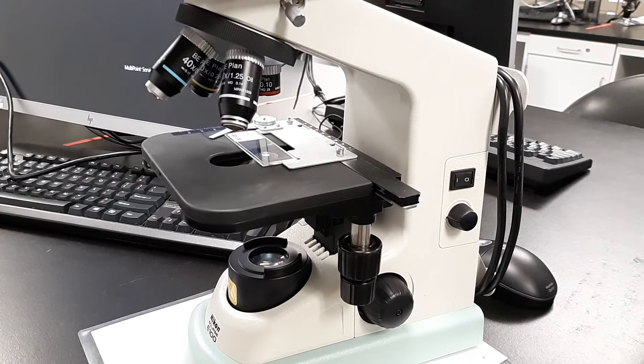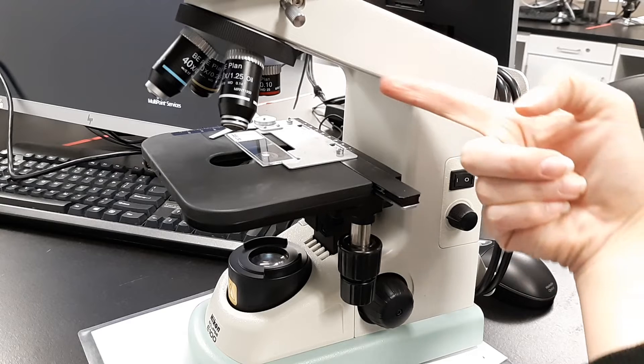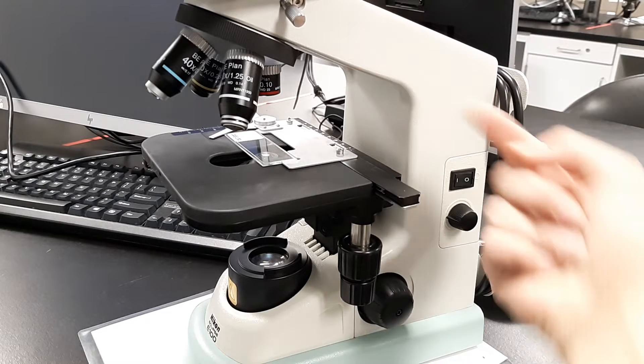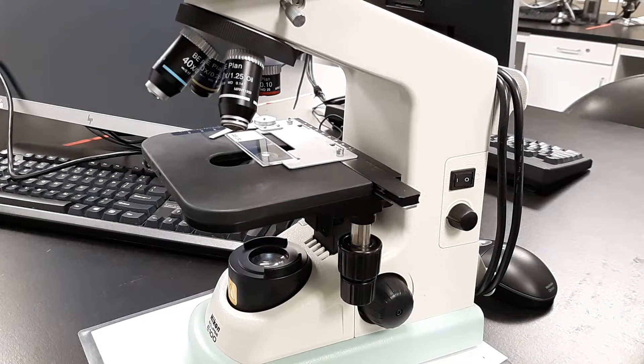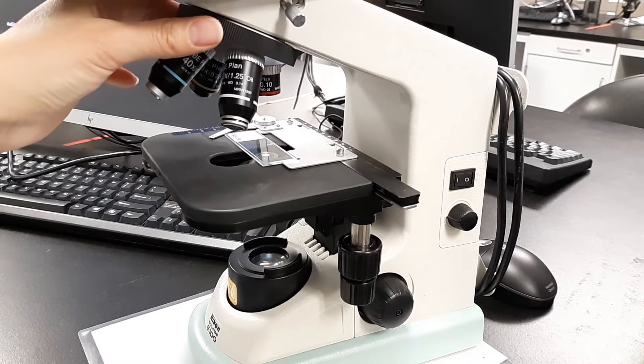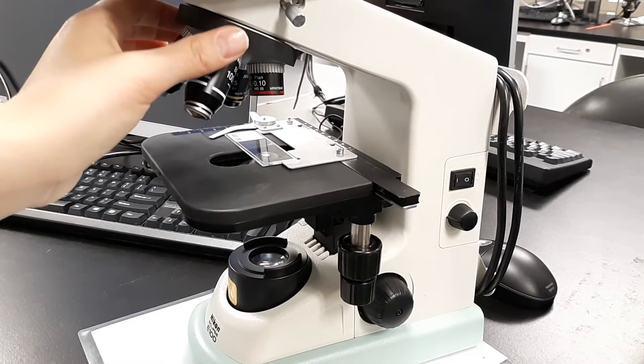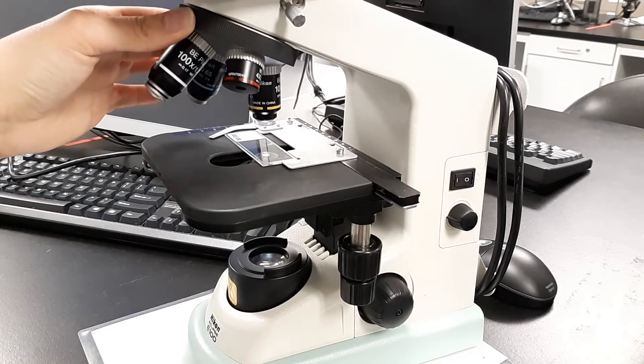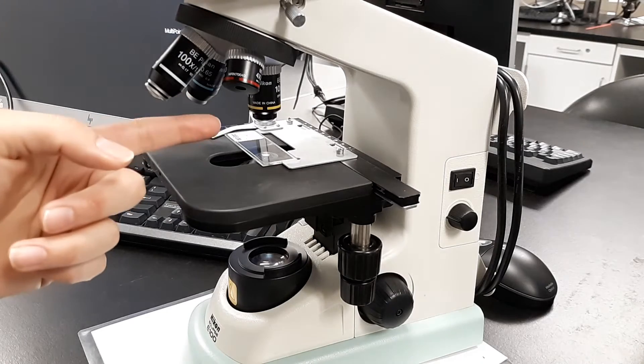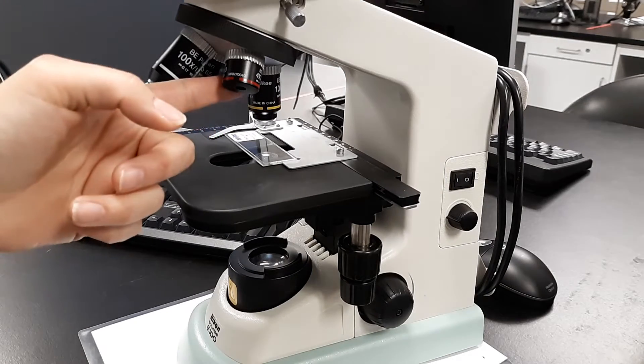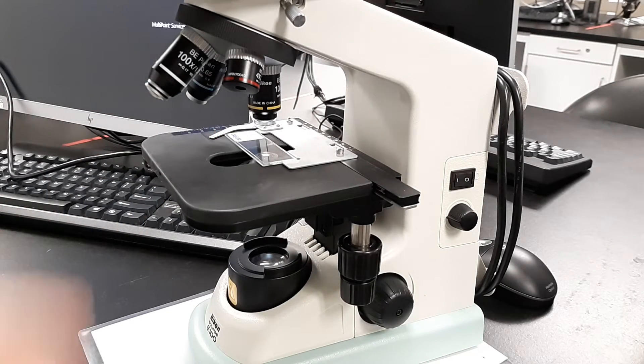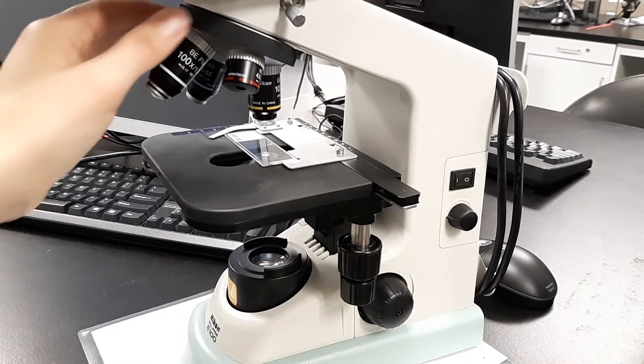Always start on the red objective right there. The red objective is 4x, but the total magnification with the oculars is another 10x, so 10 times 4 equals 40. The yellow objective—when you hear that click, you know you've gone to the next objective—is 10x times the ocular of 10, for a total 100x magnification.